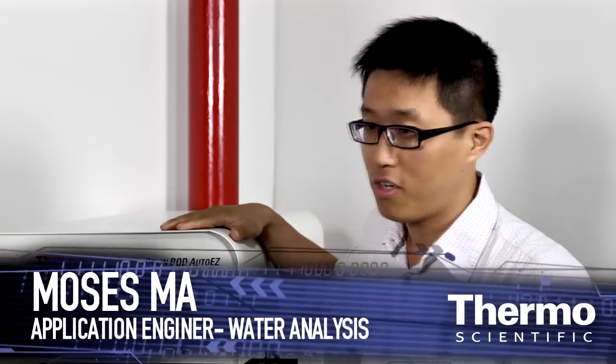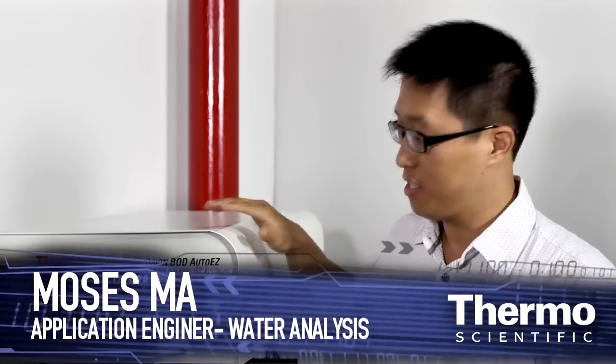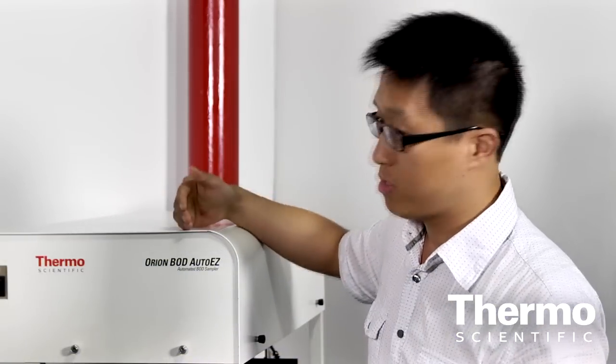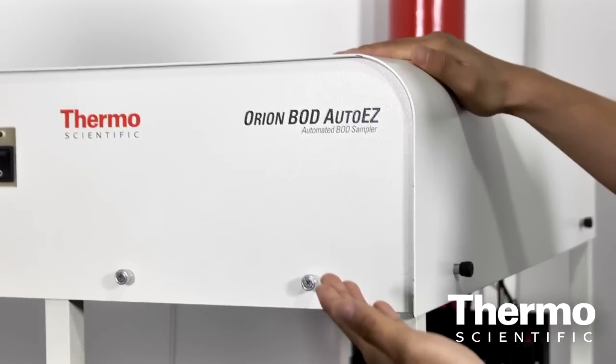This instrument is one of the larger ones in our Orion product line, whose Chinese name means BOD Automatic Analyzer.